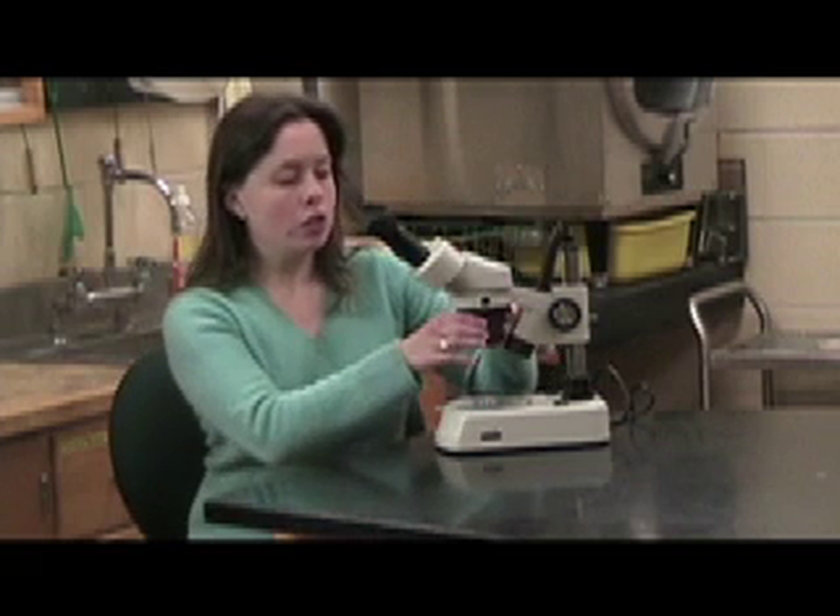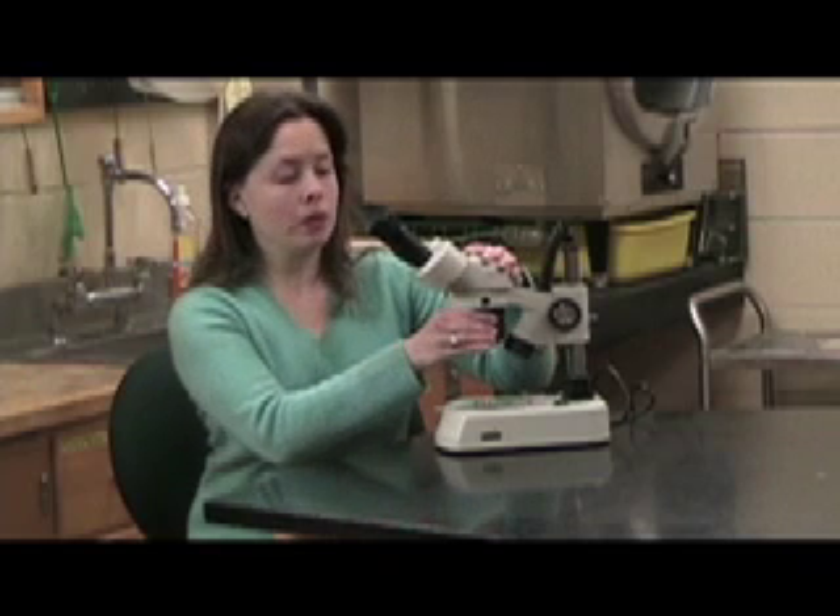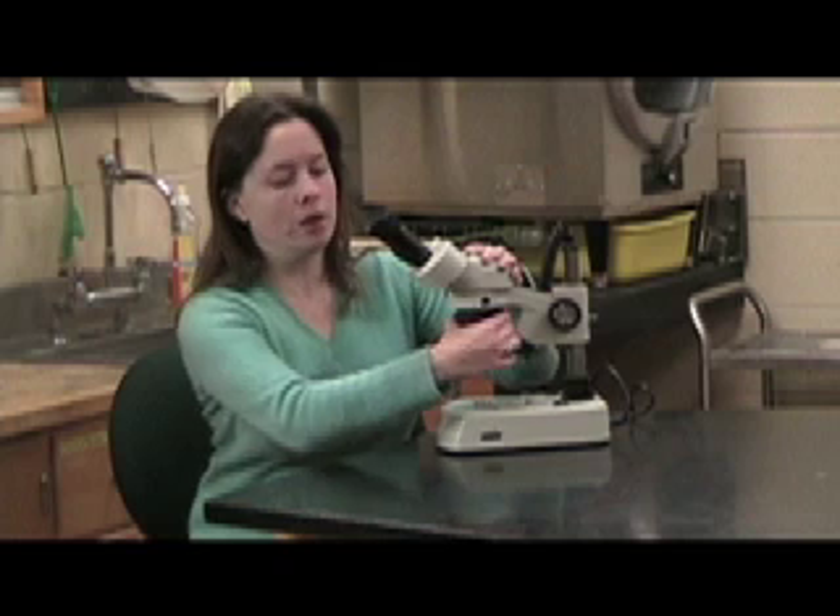The dissecting microscope has a much smaller range of magnification. The oculars are again 10X, and then we can turn and change the magnification down here to either be 1X, or if I rotate it, it will become 3X. So I can either magnify 10X or 30X.